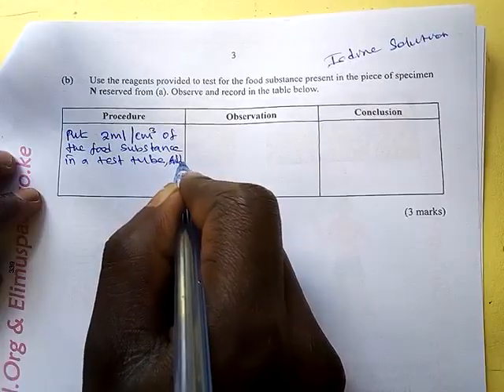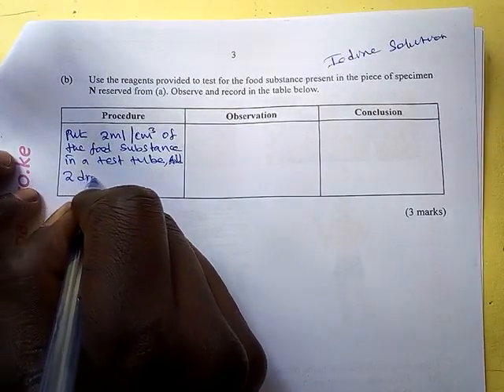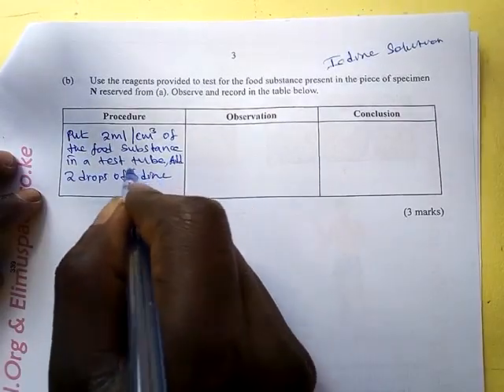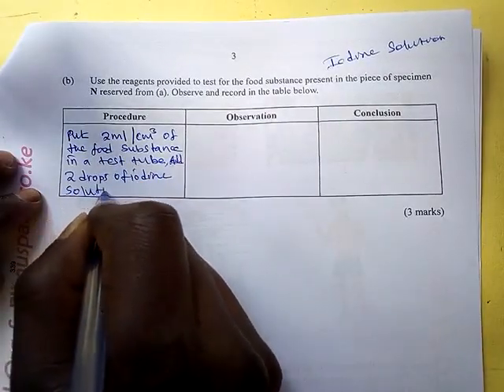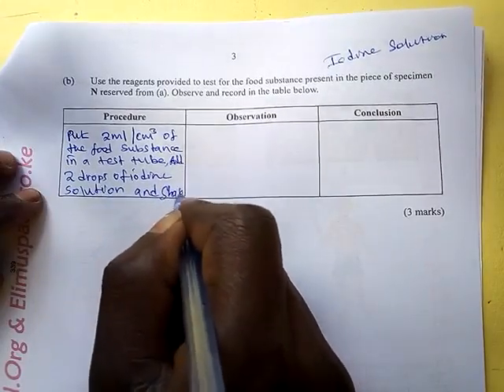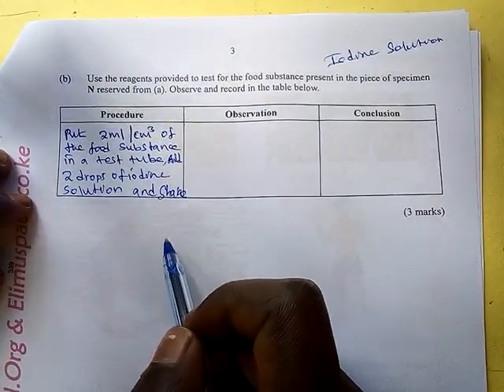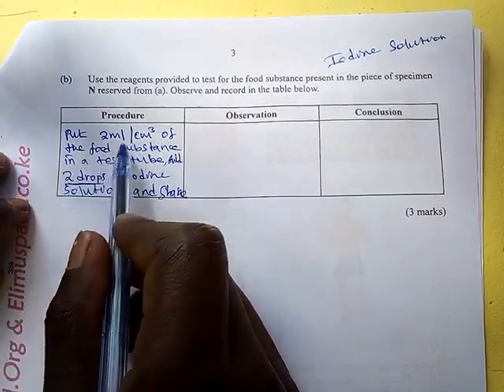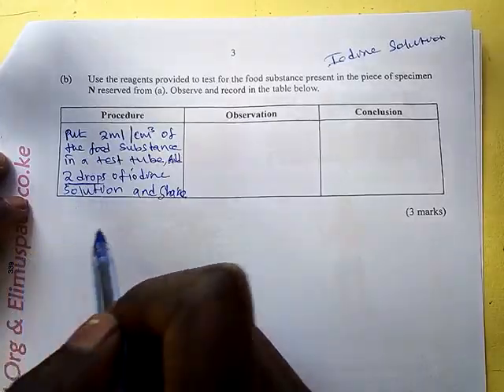add 2 drops of iodine solution and shake. That is the procedure. You should specify it is 2 drops. Don't say add equal amount. You say add 2 drops.